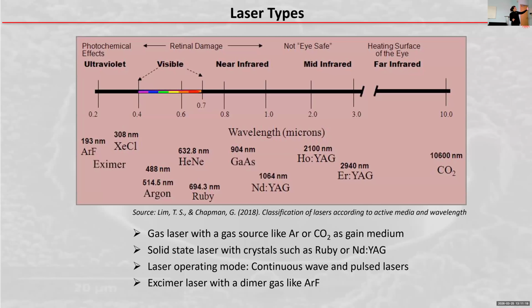And so by that, there are a lot of lasers out there. They all differ, from gas sources to solid-state sources. It really depends on the active medium. For instance, there are ruby lasers, or the very popular neodymium YAG lasers, standing for neodymium yttrium aluminum garnet, where the active medium is that crystal, or the very common one in earth sciences, the argon fluorine excimer laser.